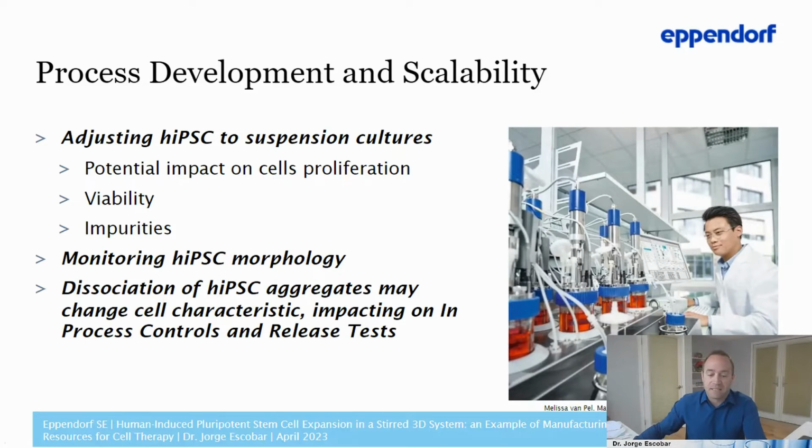In this sense, starting materials undergo an expansion process and are transferred into large-scale platforms such as bioreactors, which can subsequently be used to generate the cell quantity required for allogeneic cell therapy. We need to produce a lot of cells to be able to use them for many biomedical applications.